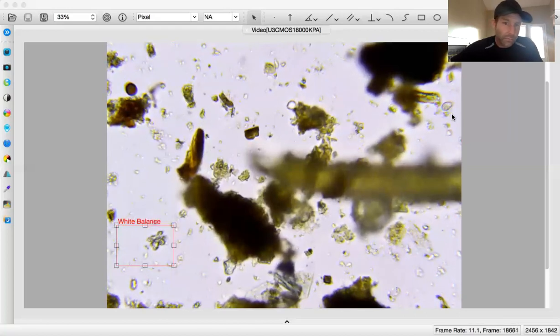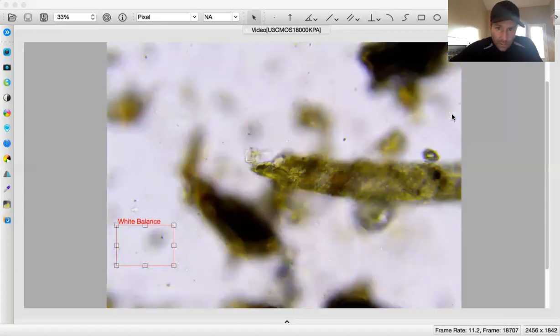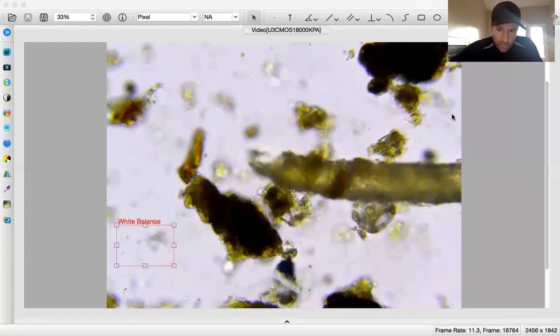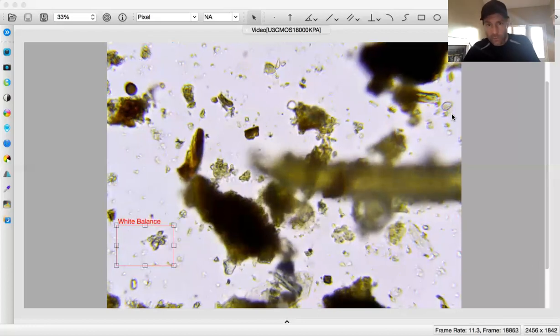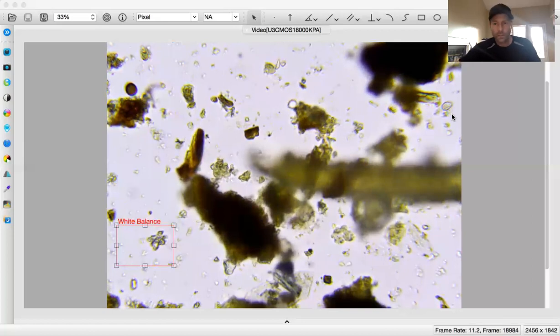So I'm going to go ahead and move past that and go to the top of the frame and just make sure there's no actino sticking out. Back down, looking at some fungi if I can, but I can't because there are none. It's like some spores I'm seeing. Okay, moving on, nothing to record. Oh, actually that's a flagellate. So we do have that guy in field of view 1. So we're going to move to field of view 2 now.